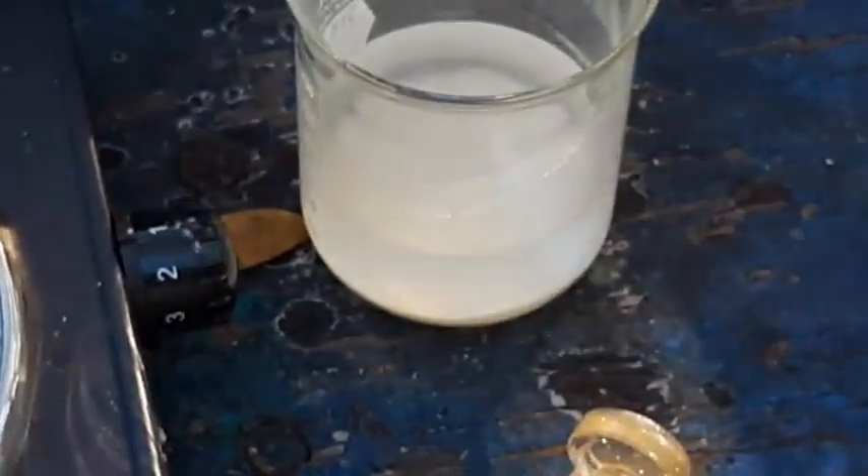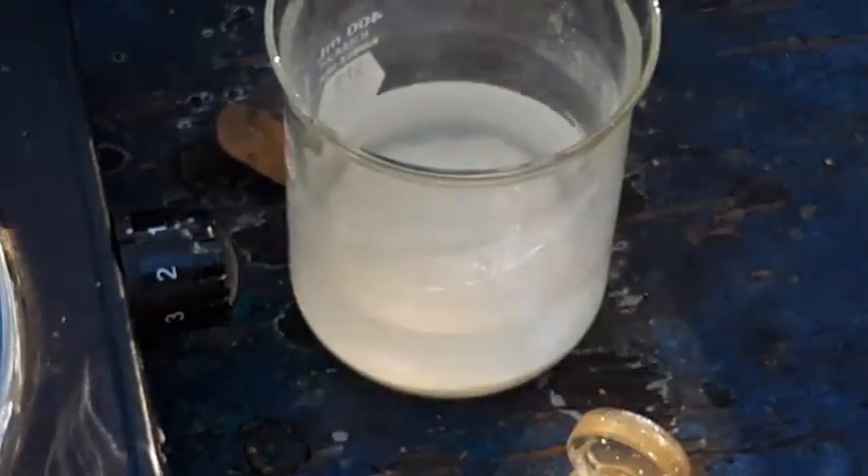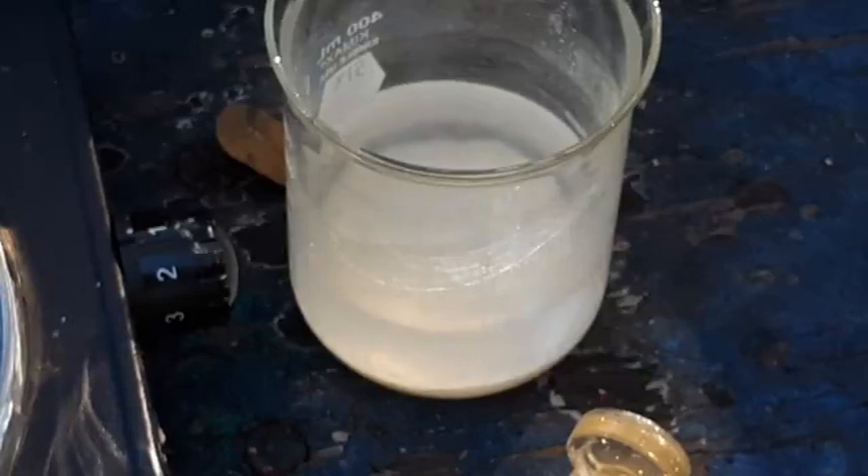Given how easy the organic textbook says oxymercuration-demercuration is to pull off, I'm almost wondering if it doesn't have to be 100% pure and we just have to live with a little bit of impurity. I mean, we're not writing any papers here.